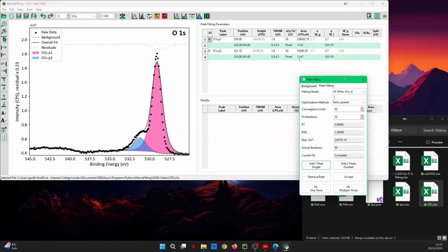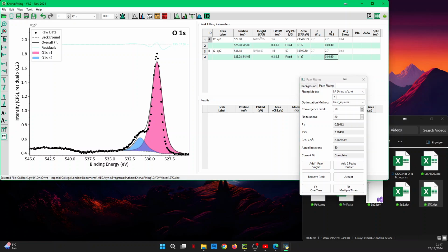Not the same width, sorry, the same shape. And the same shape here is fixed using the gamma. So the gamma is the shape on the right side, but because it's a symmetric peak, because it's 50%, sigma equals gamma. So that's our sigma, and that's our gamma power. Let's type A on this grid, A, and A will become A times 1. So B now, for the gamma, is in function of A.